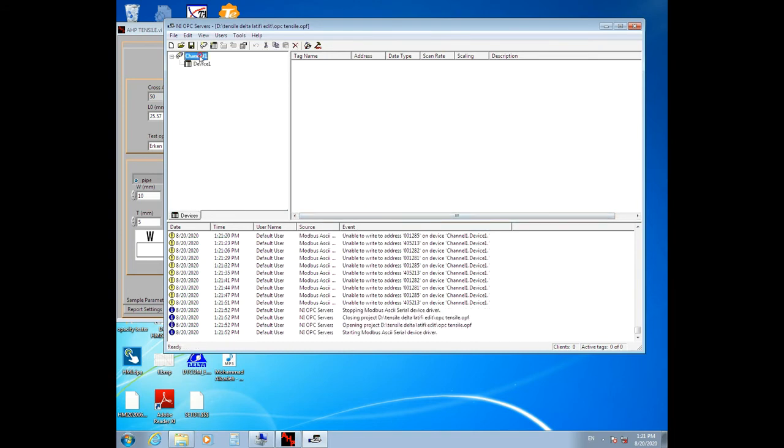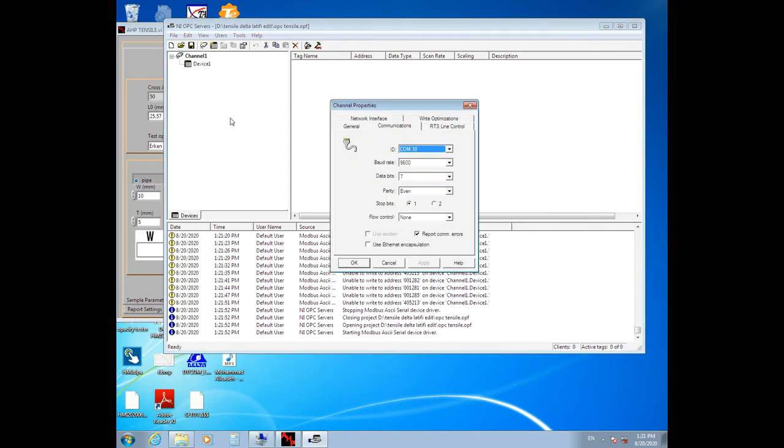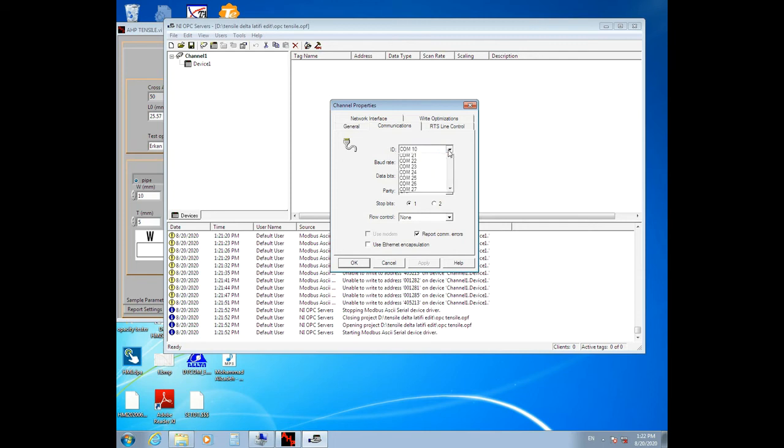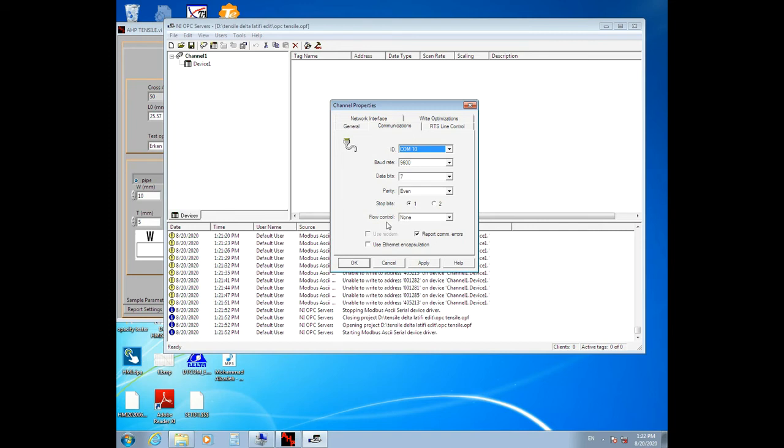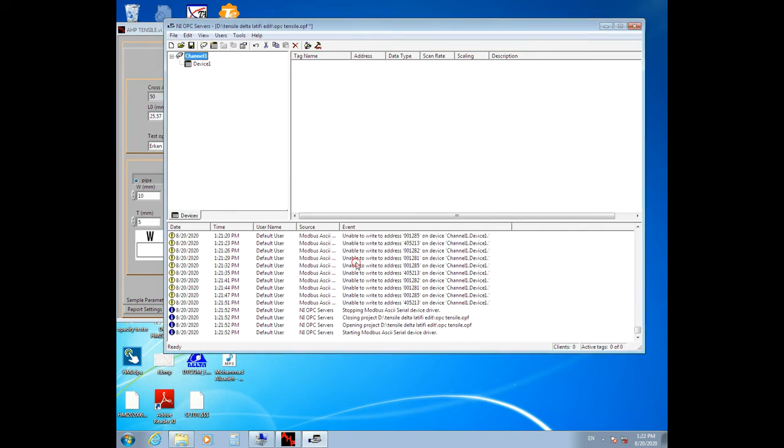Then right-click on Channel 1 and click on Properties. In the Communications tab, you will see the converter settings that must be set to COM10, baud rate 9600, data bits 7, parity even, stop bits 1, and flow control none. Then click OK.